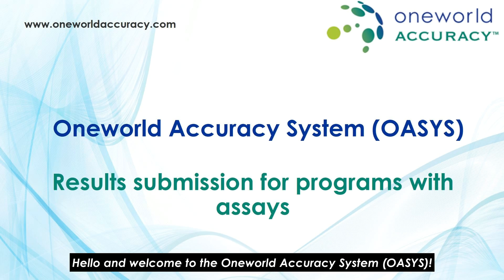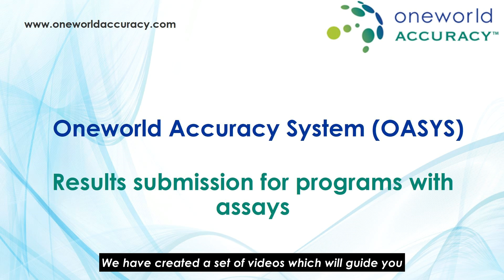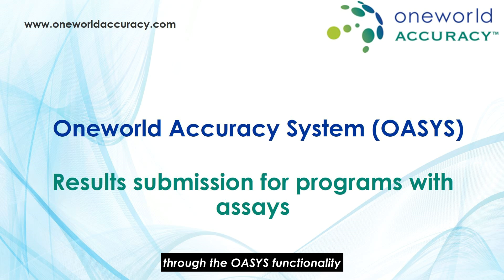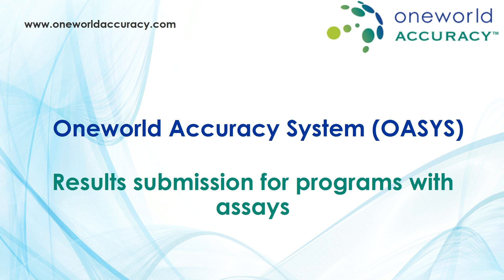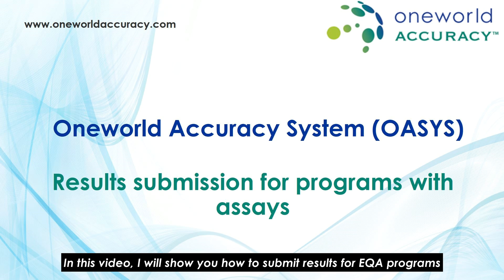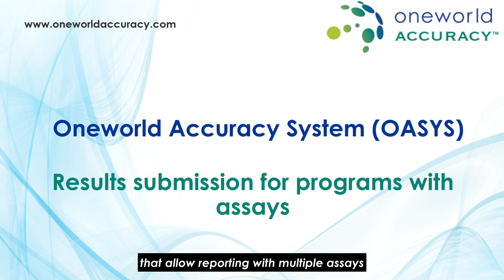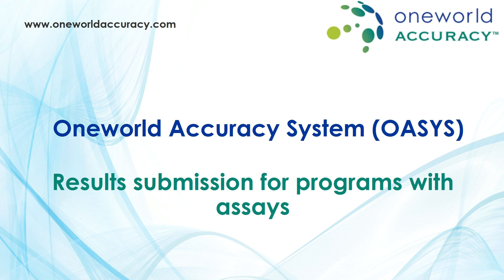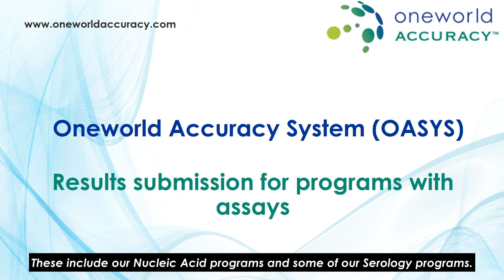Hello and welcome to the One World Accuracy System, OASIS. We have created a set of videos which will guide you through the OASIS functionality. In this video, I will show you how to submit results for EQA programs that allow reporting with multiple assays. These include our nucleic acid programs and some of our serology programs.